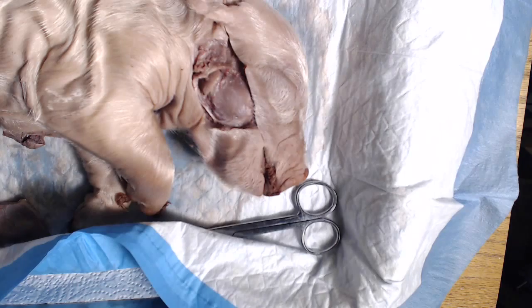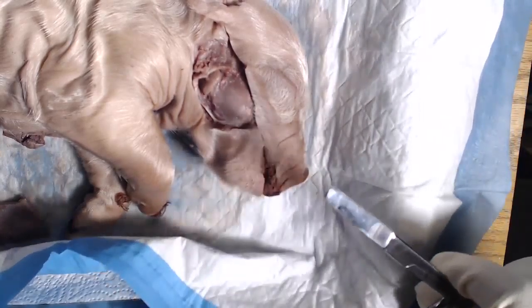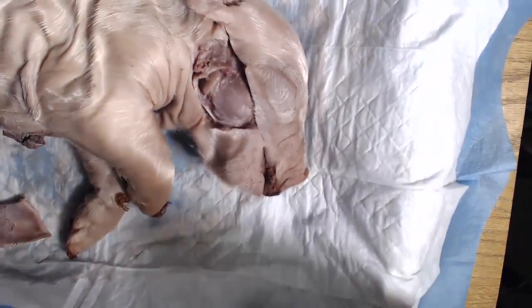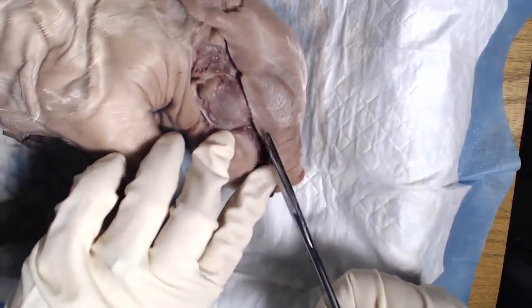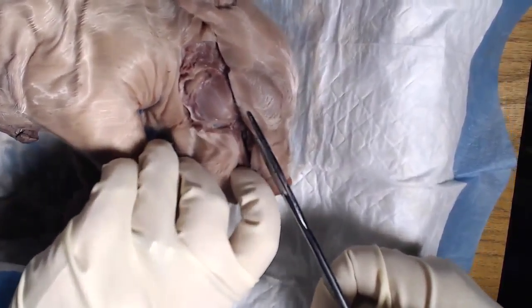All right, looks like everyone's good, so we're going to go ahead and continue with our dissection. Go ahead and pick up your scissors again. This is the point where we're going to get a little aggressive with our dissection. You're going to take your scissors and go back to where you made that initial cut at the corner of the mouth, and you want to follow it towards your masseter.